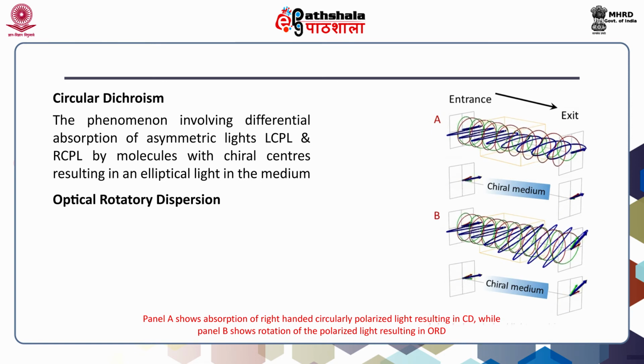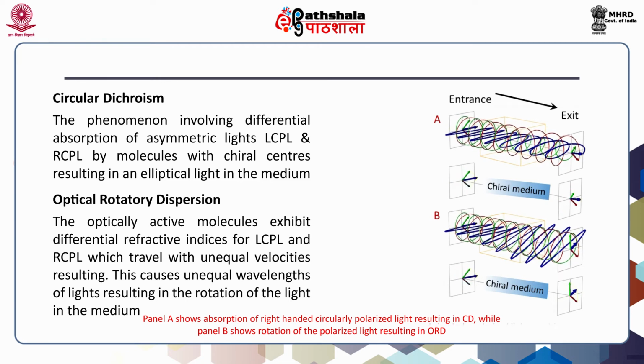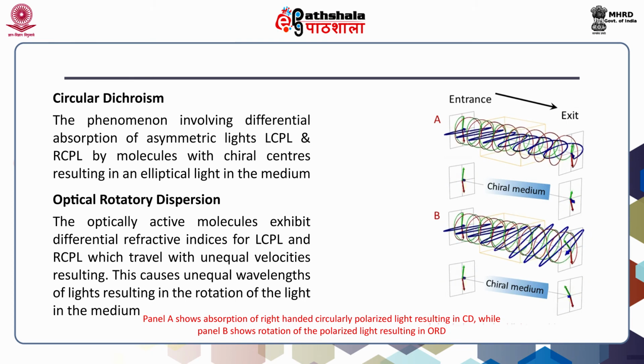So now what is the ORD? The ORD is when this rotation is taking place as a function of wavelength. What I showed here is only a monochromatic wave, that is, the wave at a particular wavelength. That is rotating and providing a particular rotation after it has traversed the medium.